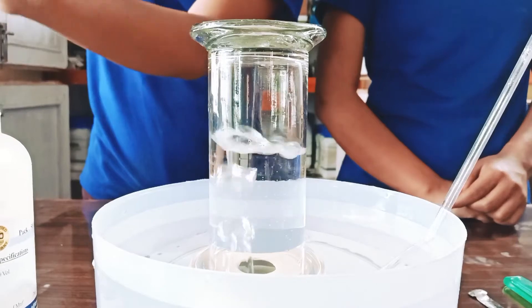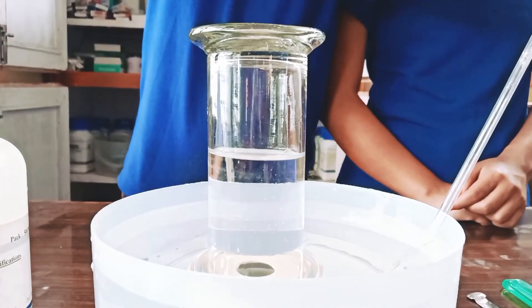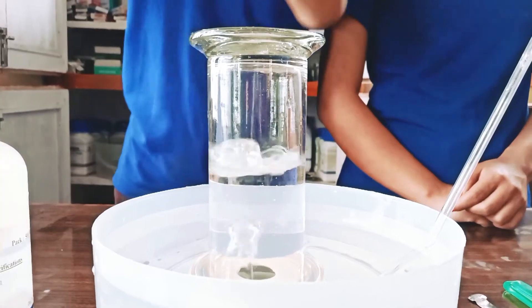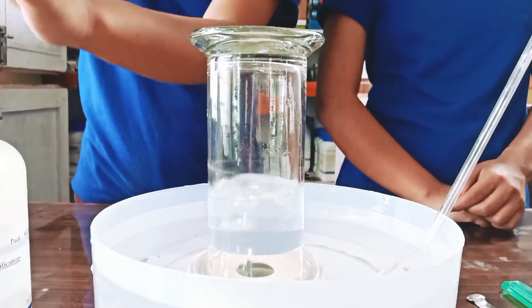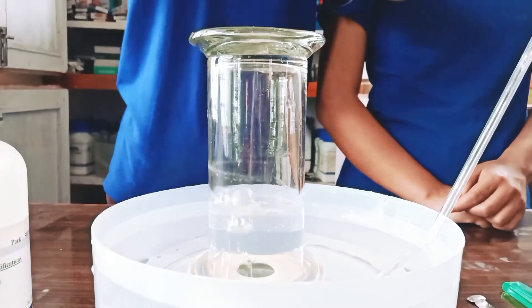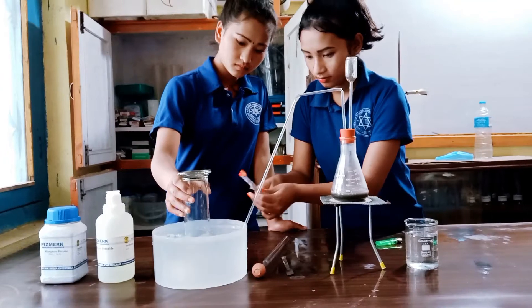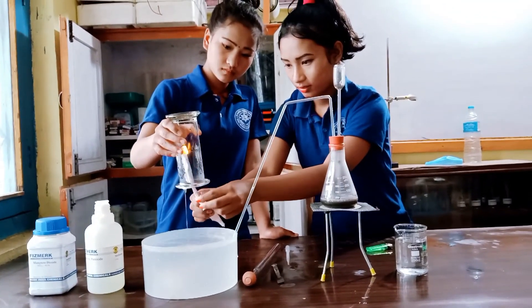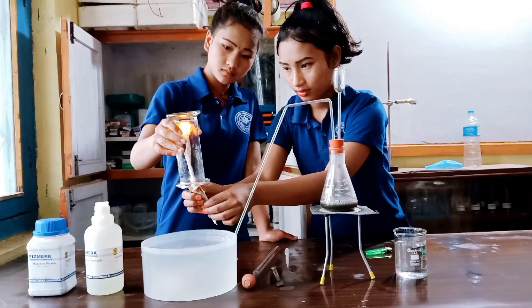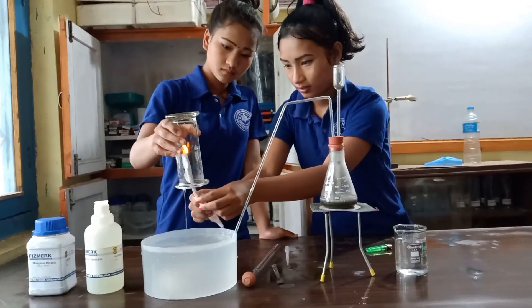The produced oxygen gas is collected in the gas jar by the downward displacement of water. In this way, oxygen gas is produced without heat. After collecting the gas, it is tested by introducing a glowing splinter into the gas jar. The glowing splinter burns with a brighter light, which proves that the gas in the gas jar is oxygen.